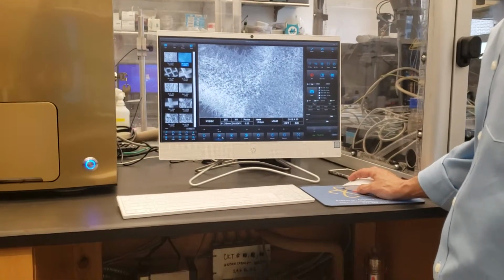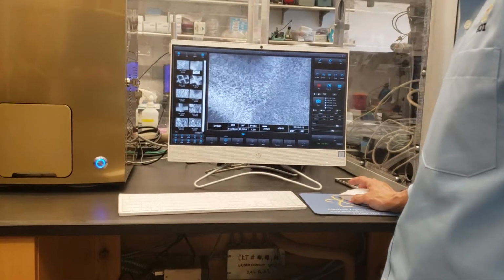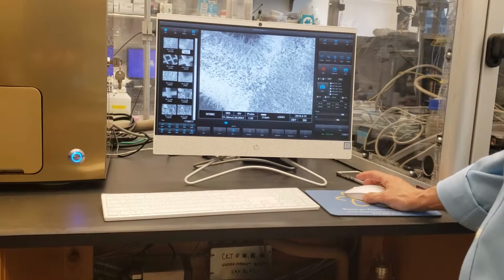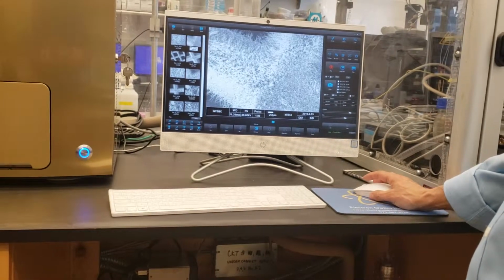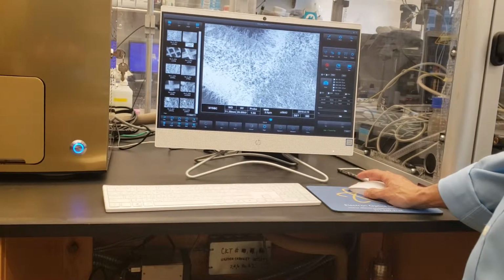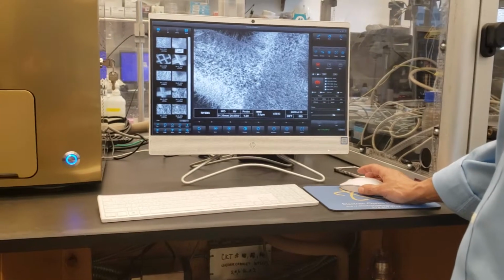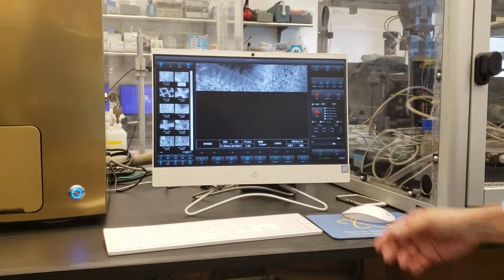So that's rotation. This is gun alignment X. I left click on it and slide it to get the brightest spot to align the beam. Gun alignment we just talked about a second ago. Gun alignment X, gun alignment Y, another slider, just looking for brightness. Right around there. And then contrast, wherever you like your contrast, and then brightness, however you like your brightness as well. Everybody likes the way the image looks differently. You might like the way that looks because it's going to give you a nice grainy look to it. I like it different. It's a taste control.